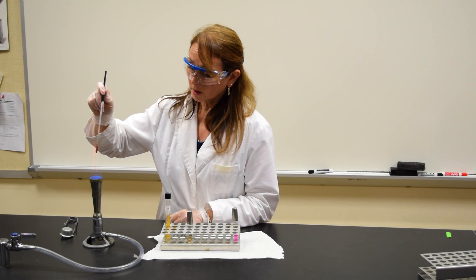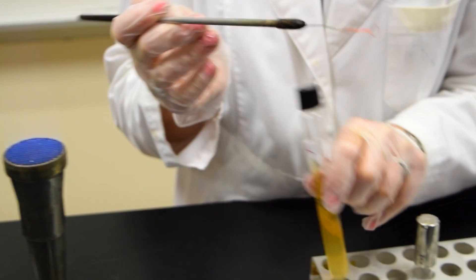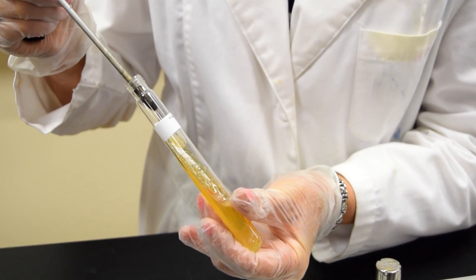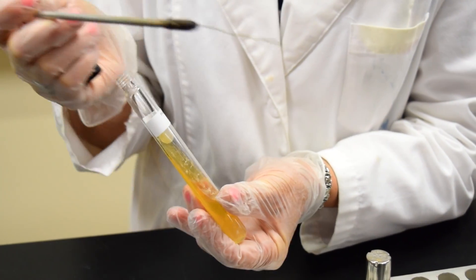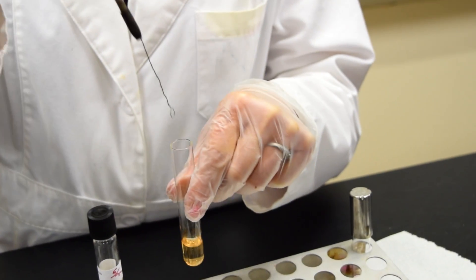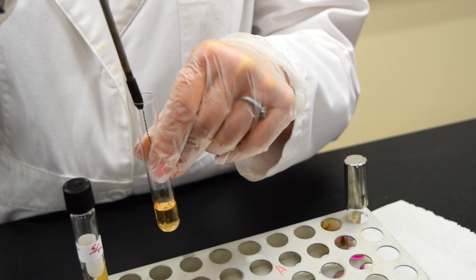I start by taking my inoculating loop and sterilize it. Take a little bit of the sample you'd like to inoculate. Touch the surface of the slant, place the loop into the broth, and give it a shake.